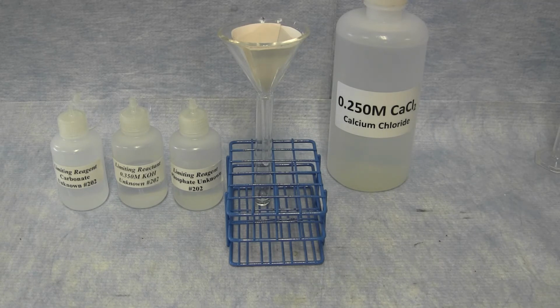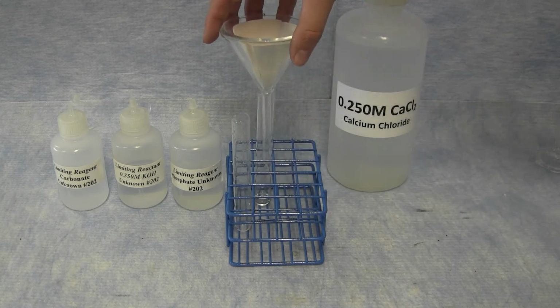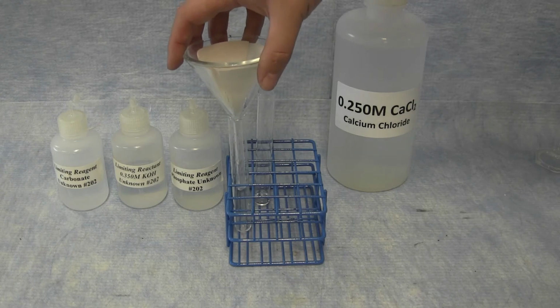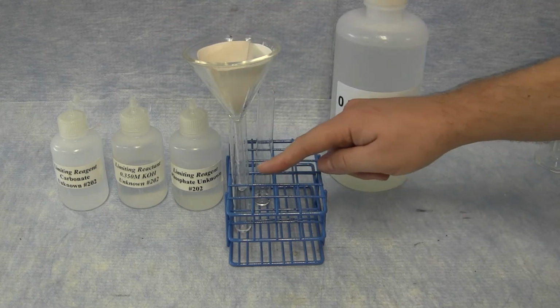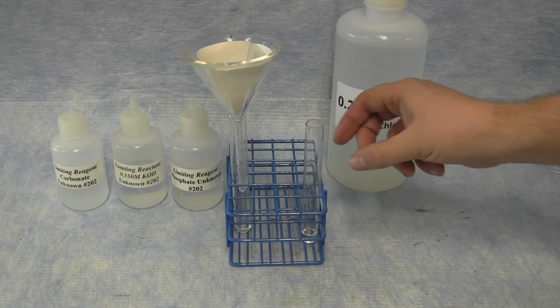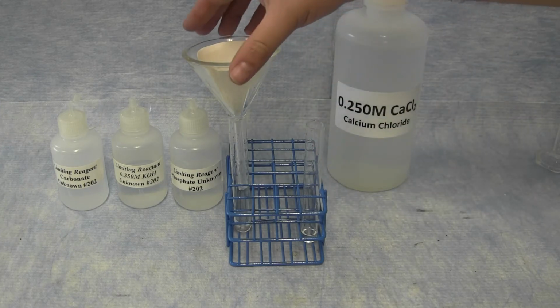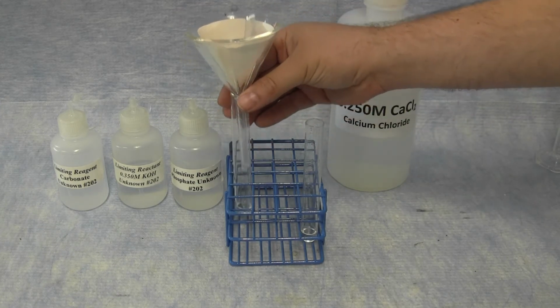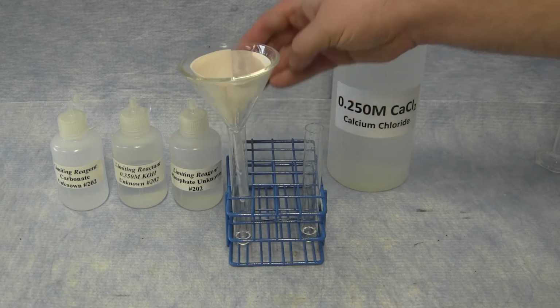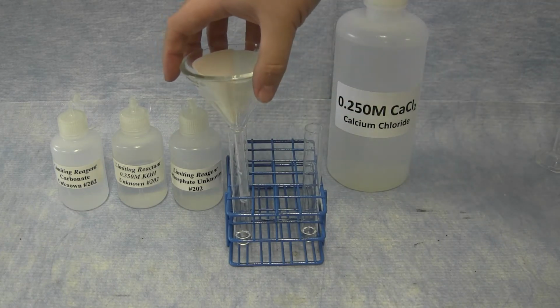When a small amount has passed into the first test tube, you can obtain a second test tube and place the funnel inside, allowing additional filtrate into a second test tube. Once you have 2 test tubes with filtrate in it, you can then begin the secondary part of the reaction.